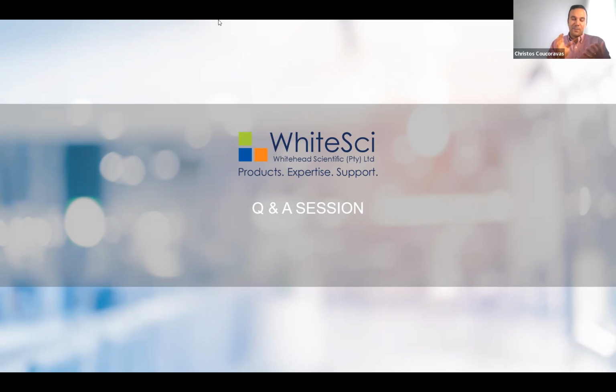Then it comes also the part that amplicon sequencing is much faster. It takes, as we said, 2 hours to prepare the libraries, 1 hour to do your normalization, while the hybrid capture has a minimum hybridization step of 4 hours, but very often we recommend it to be overnight, like 16 hours, to be sure that you are capturing your target as well as possible. It takes for sure an extra day. So those are some things that are good to consider when choosing an approach of enrichment for your applications.